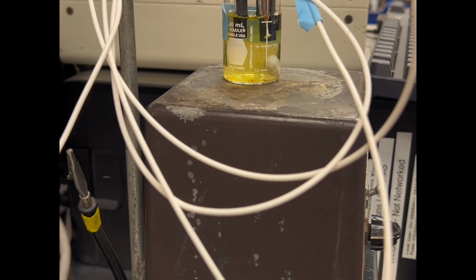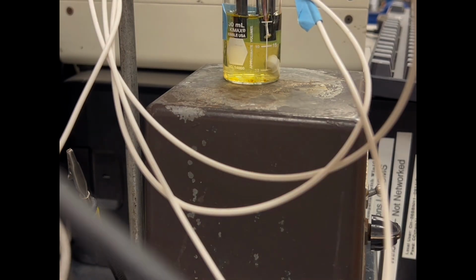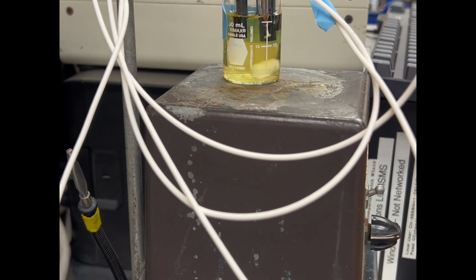and we will make sure we switch the electrode to the first electrode every time, and we'll also make sure our previous document is saved, and then we'll click run.